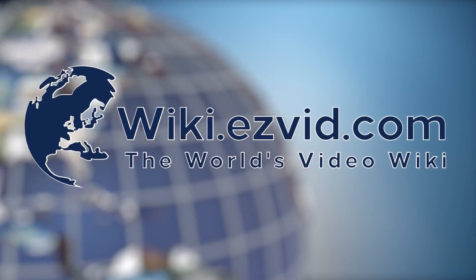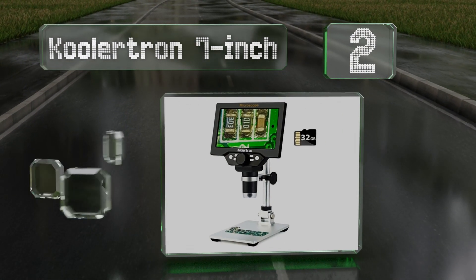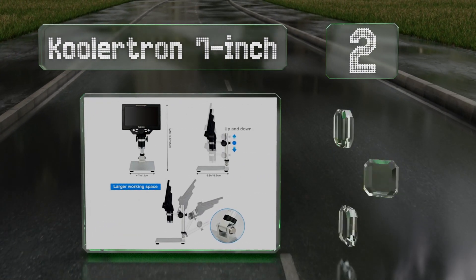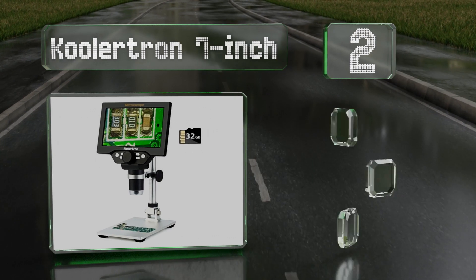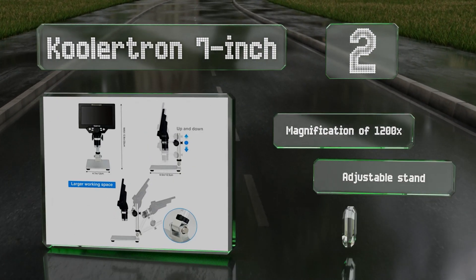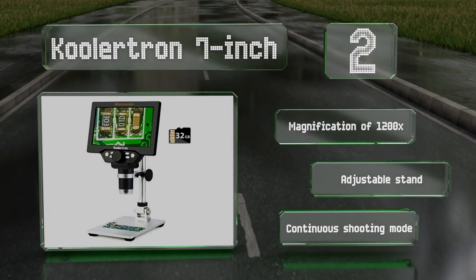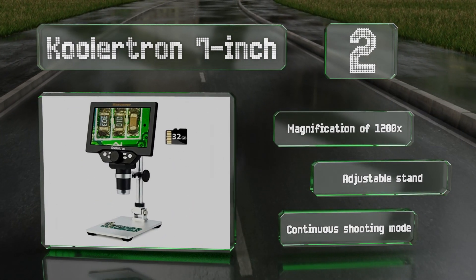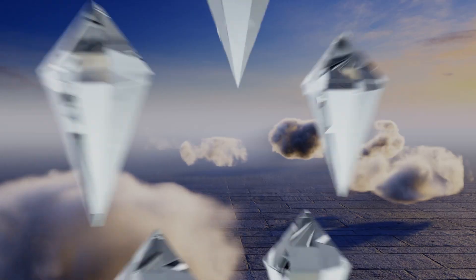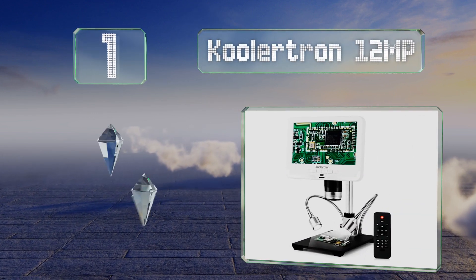At number two, the digital camera on the Cooler Tron 7 inch can capture high resolution images and videos that can be stored on the included 32 gigabyte micro SD card. It's powered by a lithium-ion battery that'll last for about four hours on a full charge. It offers a magnification of 1200 times and a continuous shooting mode, and it includes an adjustable stand.